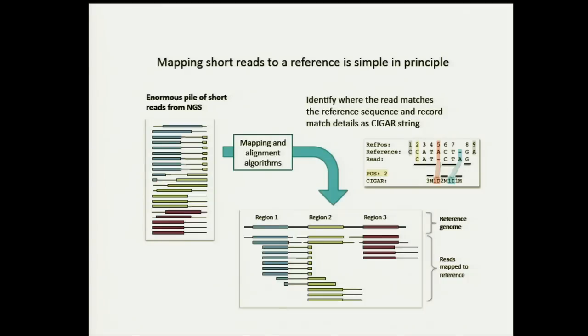Just so you visualize this, the BAM file will not have a sequence with indels marked in it. The sequence that's going to be shown in the BAM file is going to be exactly what the machine read. The machine doesn't read deletions. There's no such thing. It's a concept, not really. There's no deletions in the genome. The machine will read a sequence of letters for us, of nucleotides, and the Cigar string will tell you how to actually place those bases onto the position that the mapping has told you this read goes.